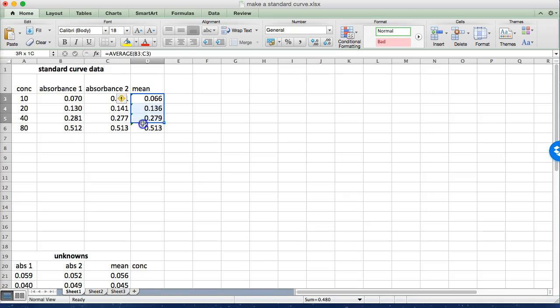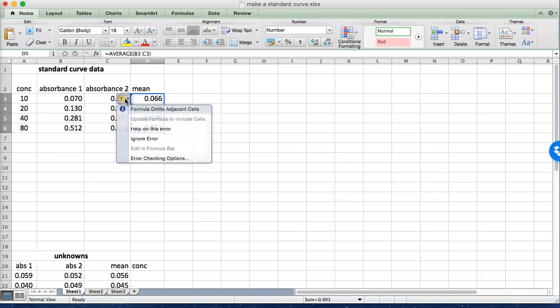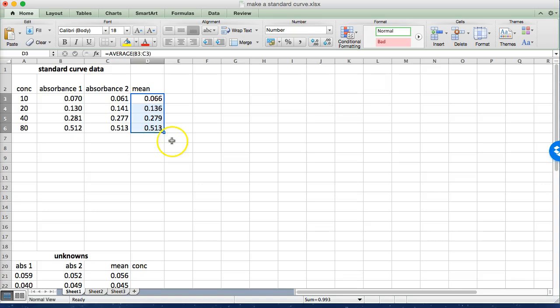You can get rid of these little green tags if they're bugging you, just highlight them and then say ignore error. It doesn't change anything, it's just kind of irritating when they're there.